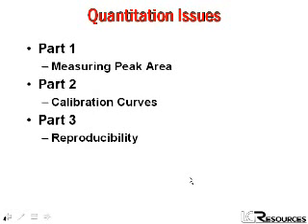Well, the seminar that we're looking at today has three different areas. First of all, we're going to take a look at the measurements that we make in the chromatogram, and then we'll see how we can take these measurements and convert them into some useful information. And then finally, we'll consider some of the factors that play a role in the reproducibility of your results.